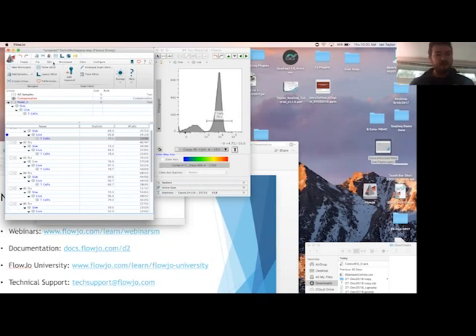So just to demo how this tool would work, go to the workspace. Include no more than. Yeah, okay, I'm getting another question. A user's asking, can you use the include no more than function instead of downsampling when concatenating? Actually, you can't. The reason being that feature actually has a problem currently. So it's something we're hoping to fix in a future release. For the time being, we recommend using the downsample option.